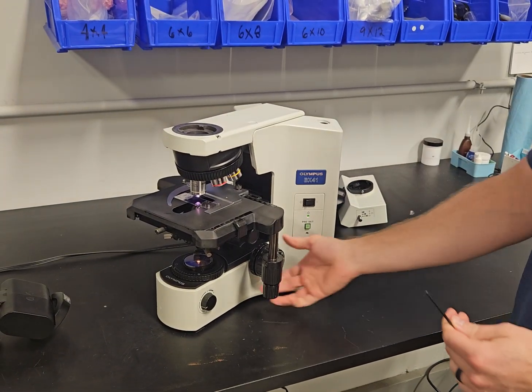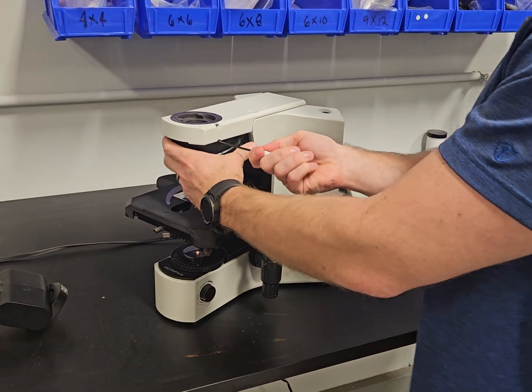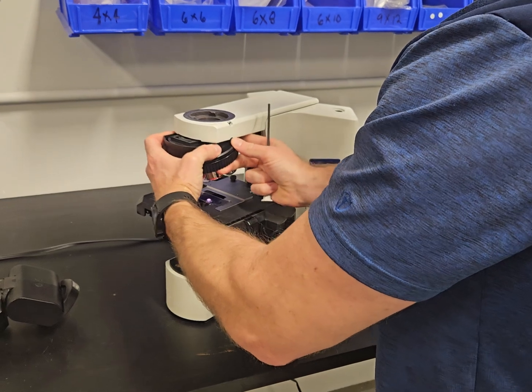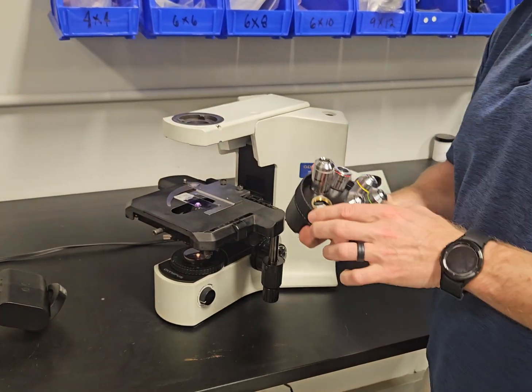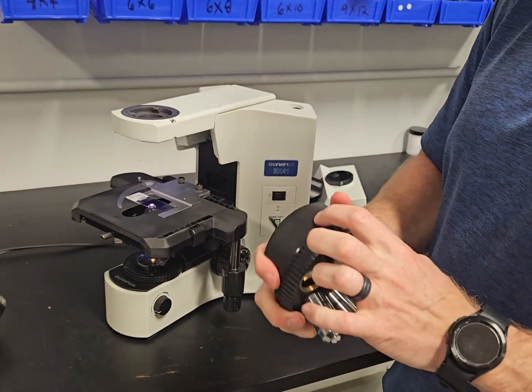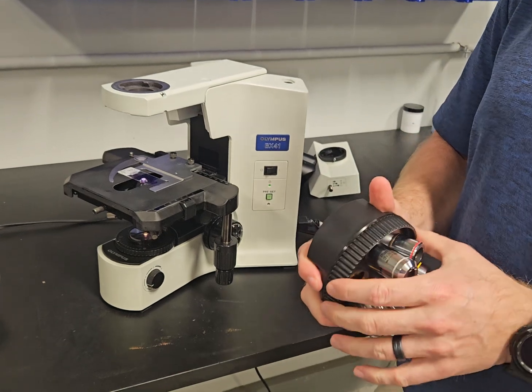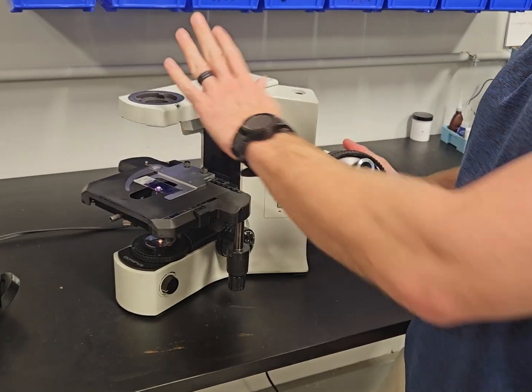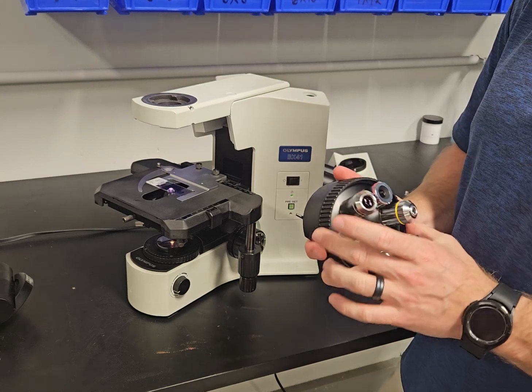Then we're going to drop the stage down. We're going to talk about the nose piece. This has a six place nose piece on it and this does not have the slot, but you can get it with the slot for the analyzer as well. This scope usually comes with a five place nose piece on there.